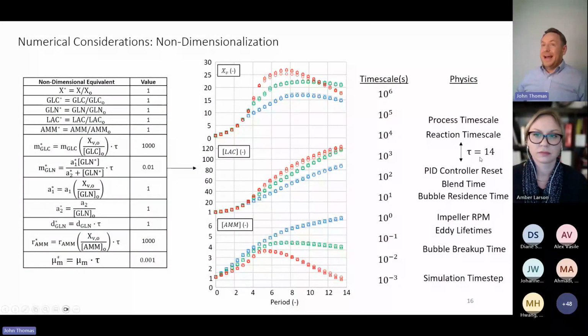And so I would have a very hard time convincing myself to have a process that was shorter than like 6 hours. Even a 6-hour process is pretty fast. You're getting close to the response time of the PID controllers. But if we're at like a day, or even 12 hours, 16 hours, then you're pretty safely decoupled from those faster timescale physics.